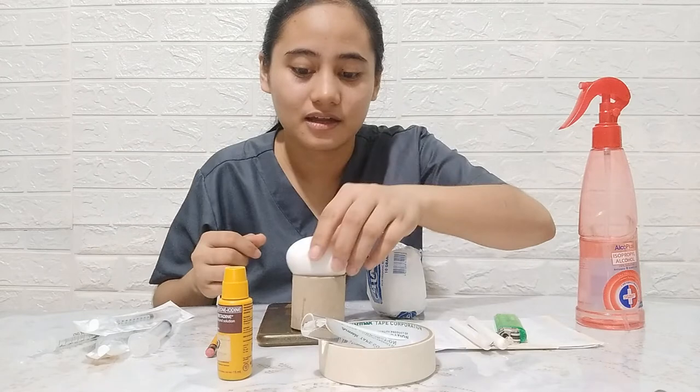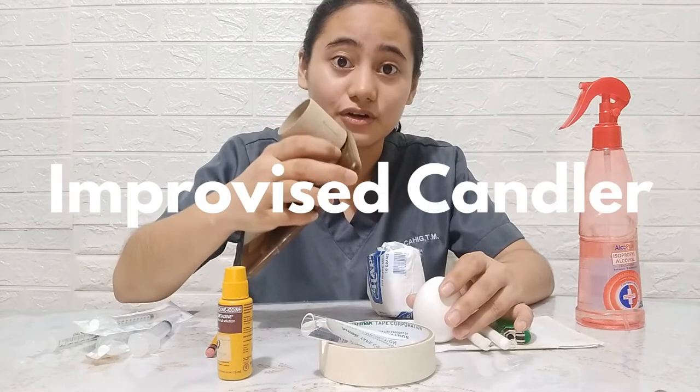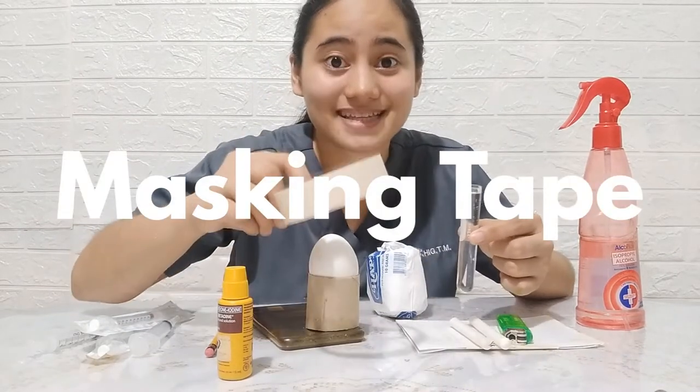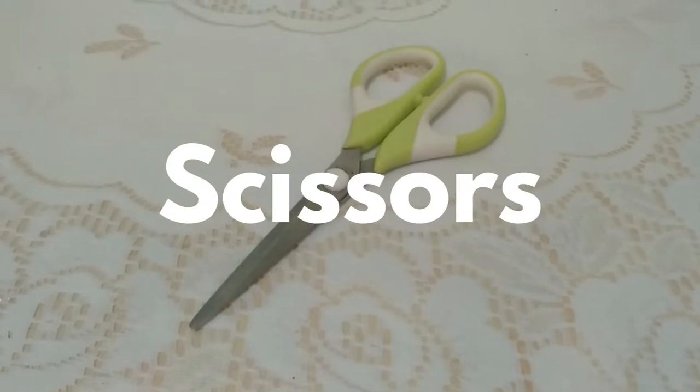When no embrionated egg is available, a table egg can be used. Additional materials include: candler, distilled water, masking tape, and scissors.